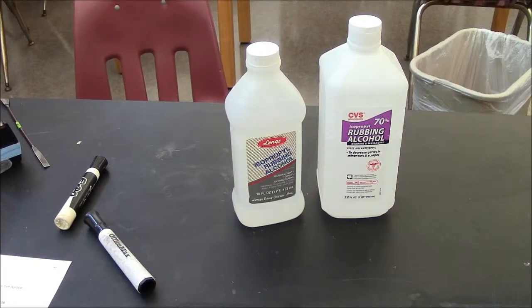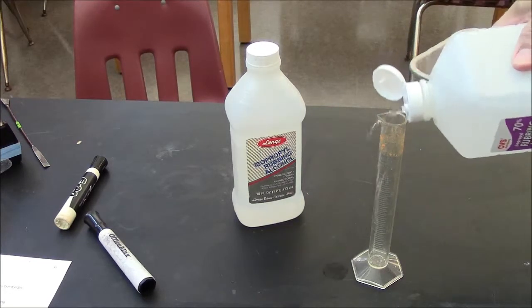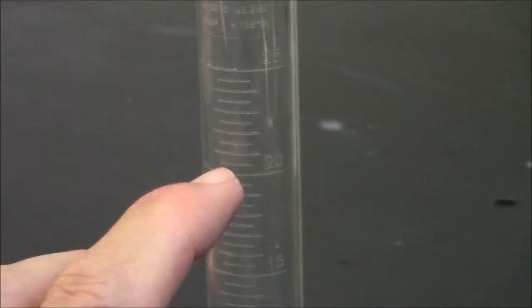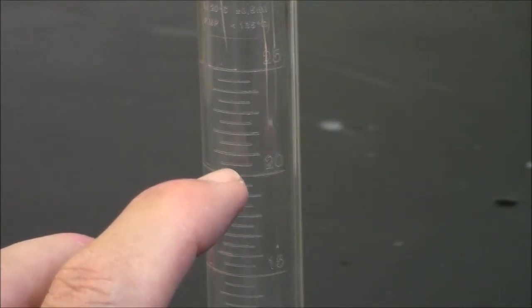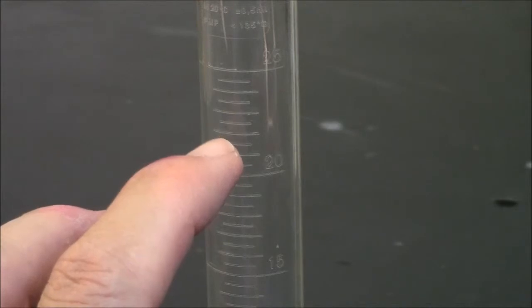When using the rubbing alcohol, please bring your cylinder to the buffet table and measure out what you feel is an appropriate quantity. Take that to your table. Be careful when you read your graduated cylinder. Some people assume that a line is a milliliter, but it's not true. 20, 20.5, 21, 21.5, 22.